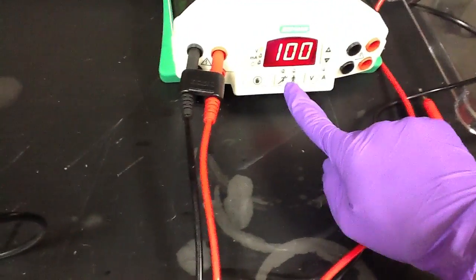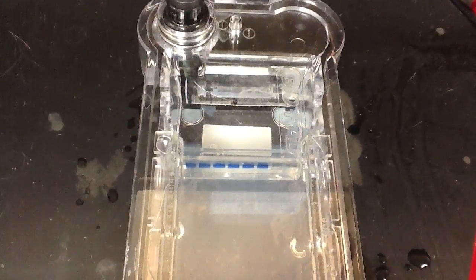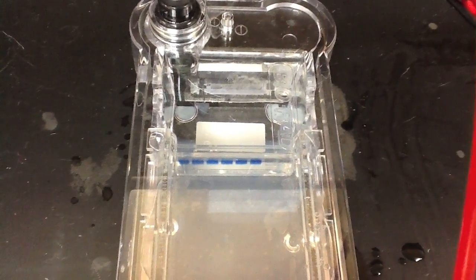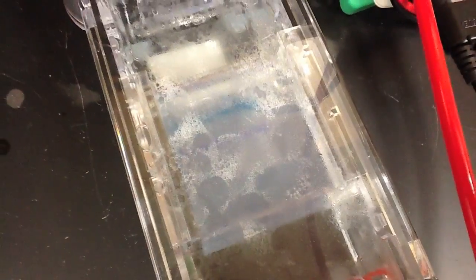We set the voltage to 100 volts and press the running man to make it run. When we do this, we actually see bubbles arise from one of the leads, letting us know that there is electricity passing through the TBE buffer and therefore through the gel.